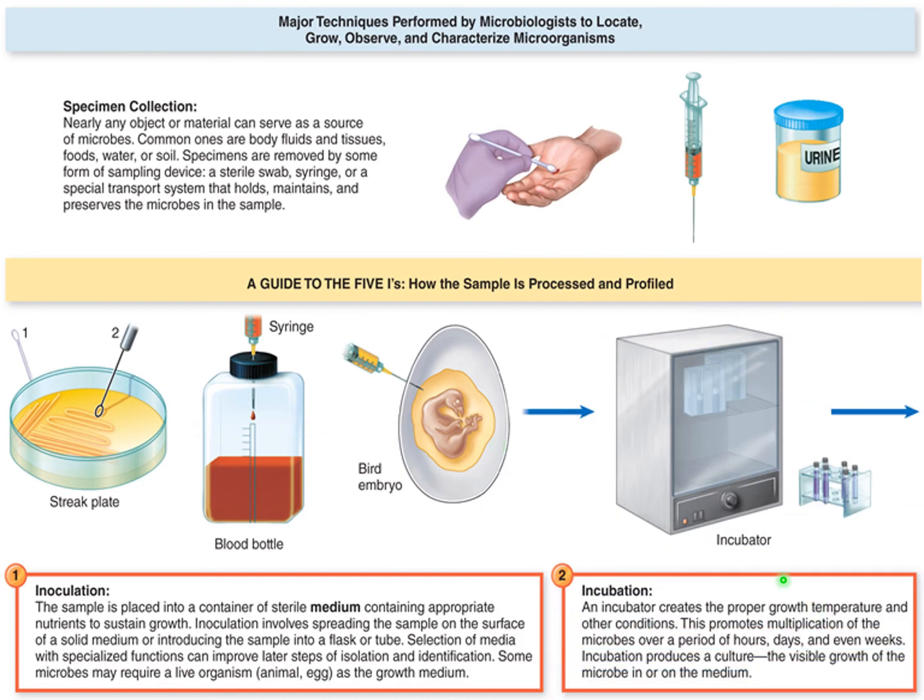All of these samples then will be grown in the laboratory. And this is through the process of incubation. In our laboratory, we have incubators that are set at 37 degrees Celsius. What is 37 degrees Celsius? It is 98.6 degrees Fahrenheit. So 37 degrees is body temperature. If we allowed microbes to simply grow at room temperature, that would be approximately 25 degrees Celsius. We also can set the incubators for higher temperatures, such as 55 degrees Celsius. And this would be for growing organisms that like it hotter than body temperature.